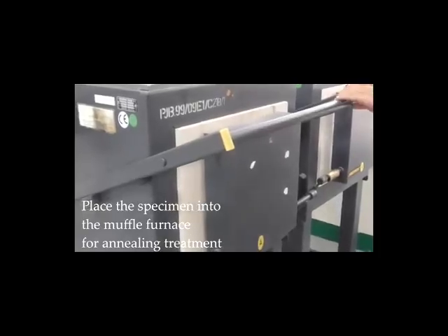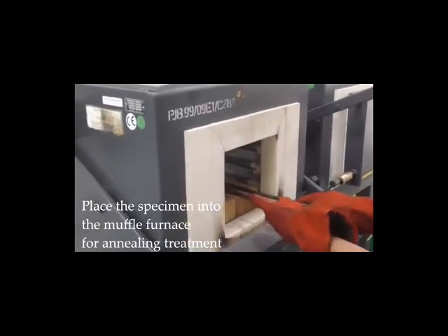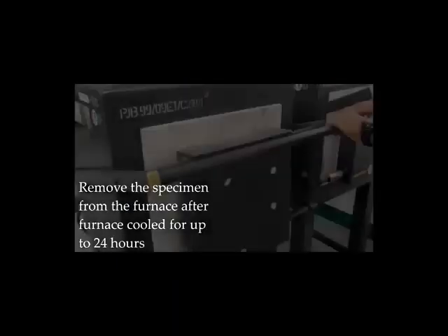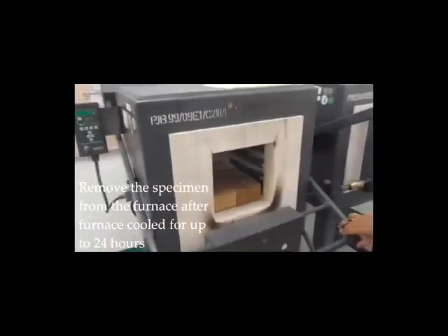Place the specimen into the muffle furnace for annealing treatment. Remove the specimen from the furnace after furnace cooling for up to 24 hours.